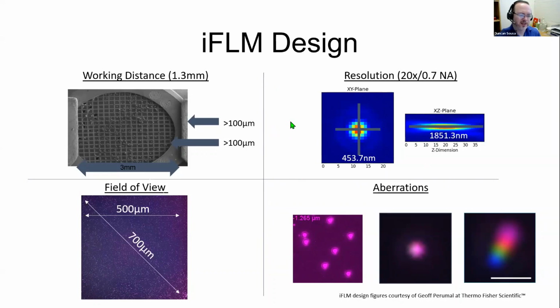2,000 nanometers. Now, if you recall, I want my sample, my lamella, to mill down to, say, 100 or 200 nanometers. So if my target is only 200 nanometers thick, well, this level of resolution is difficult, especially in Z. However, if I can target in XY instead, I've got a much better chance of at least clipping my sample and getting it in the lamella.